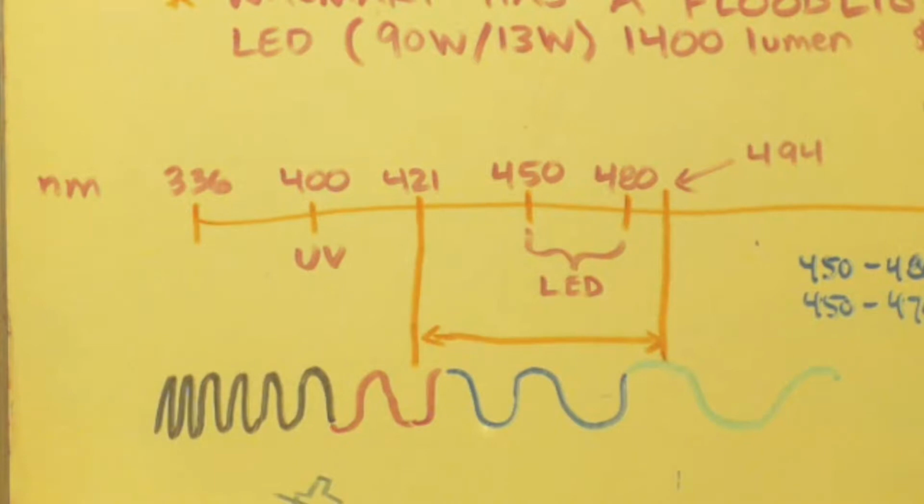It's blue light. Why is it great? Because it's only blue light, and that's it. When you do a free radical chlorination like this, a benzyl one, you need to turn off all the other lights and block out the sun. If you have any windows, curtain them up. If you have an overhead light or any other fluorescent or incandescent lights or any kind of lights, turn them all off because they are producing small amounts of UV and violet light.